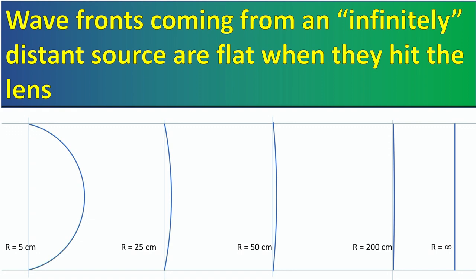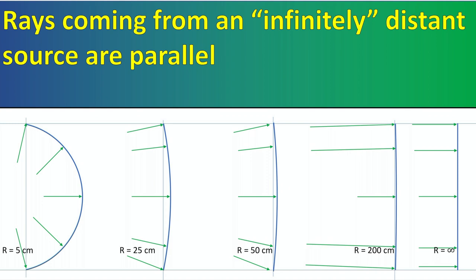Well, you're thinking that your microscope is not infinitely long, but think of infinitely corrected microscopes. In these, we'll see that lenses generate flat wavefronts as if they come from infinitely far away. Now we look at the rays from various wavefronts. Close to the source of light, the rays are clearly pointing in different directions. But as we get further from the source, the rays we see get closer and closer to being parallel to each other. From a source infinitely far away, the rays are indeed parallel.